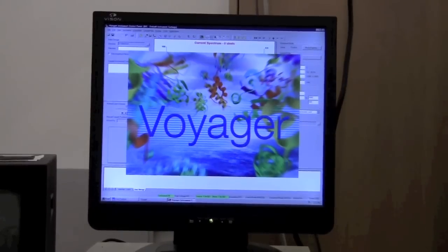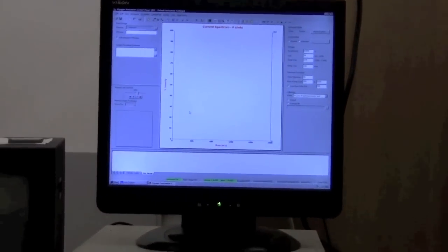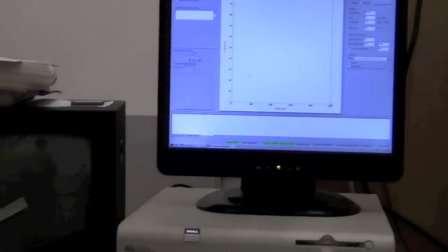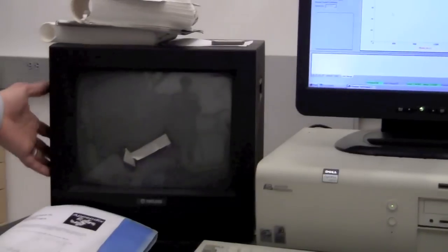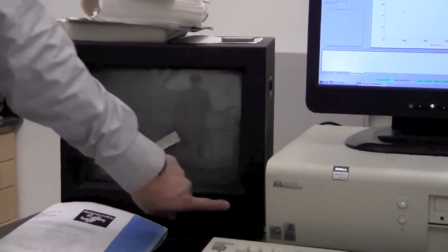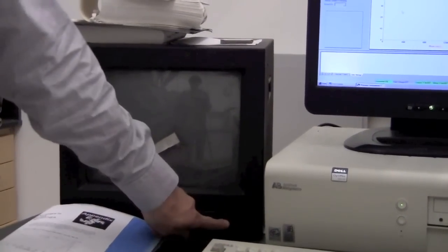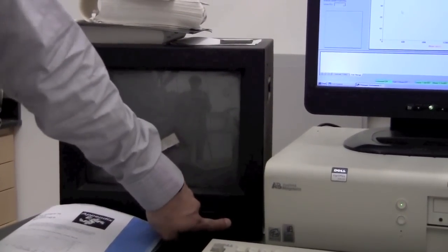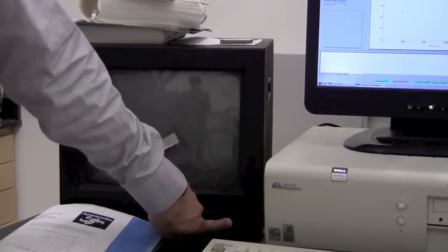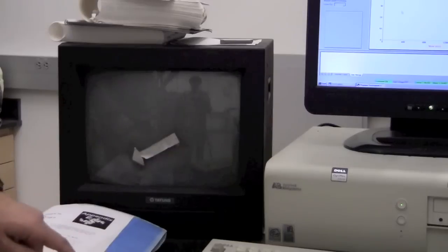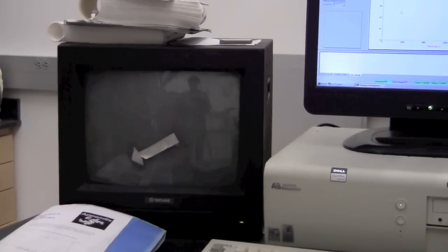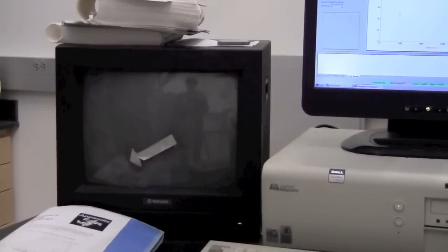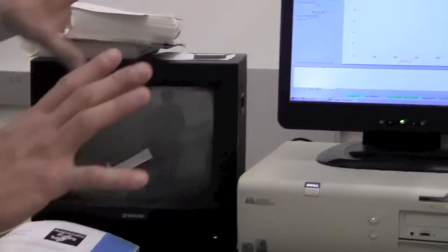Also, the television monitor should be off before you come to use it, and so the first thing you should do is start the television monitor by turning on the power here. Now that it's ready for you to use, you can look at a couple things.